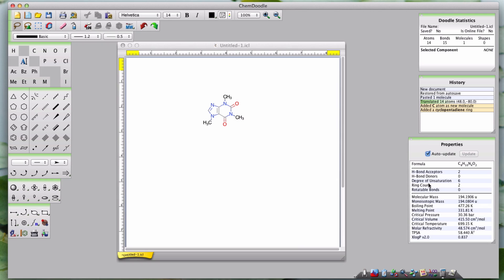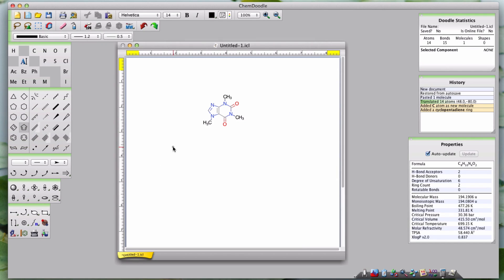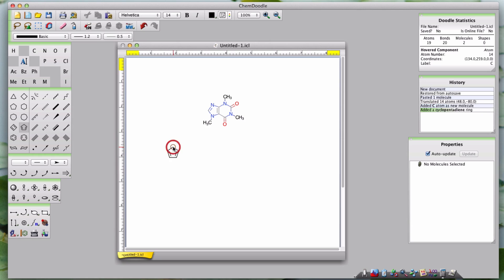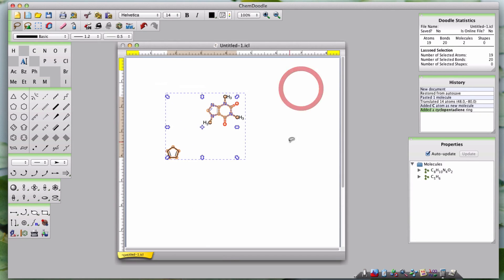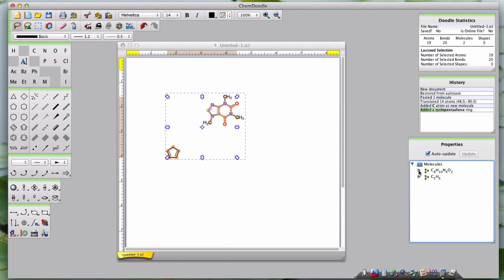If a single molecule is drawn, a table will be displayed. If multiple molecules are selected, a drop-down tree will appear, which allows you to view data for each of the selected molecules.